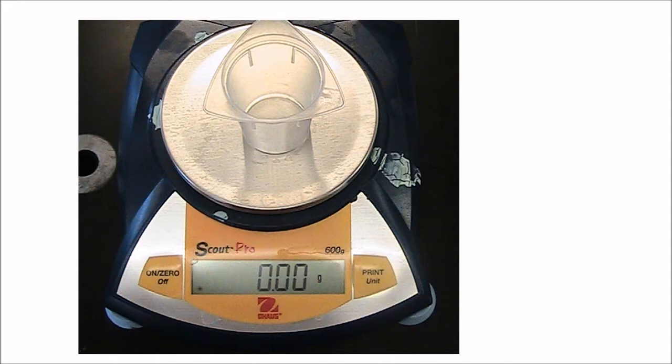When you use these balances, or any kind of electronic balance, write down everything, all the digits here. We've paid for all of them, so write them all down. Also notice out here where the G is, that's gram units. If this doesn't look like a G, press the unit button until it does, because you want to make sure everything you do is in grams. That's true today, and that's true through the entire two-semester sequence of General Chemistry. There aren't really any cases where we're going to measure in newtons or strange things like that.